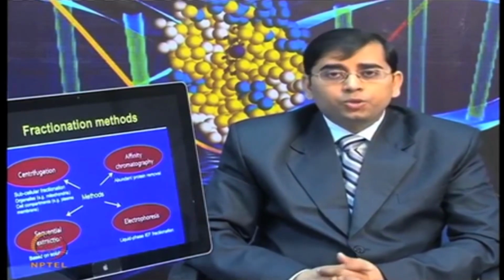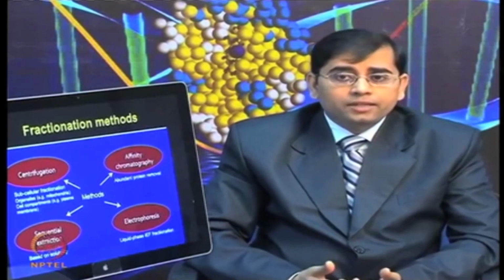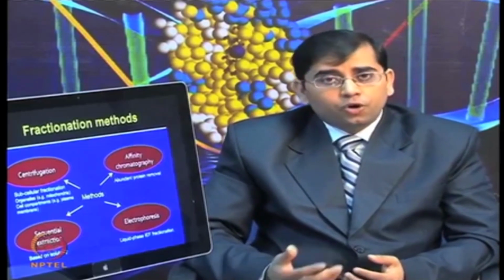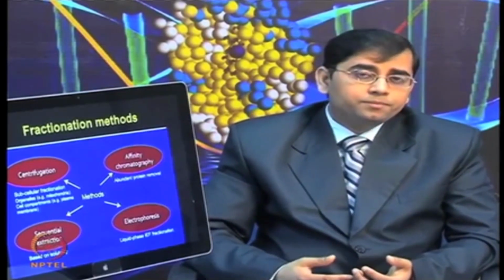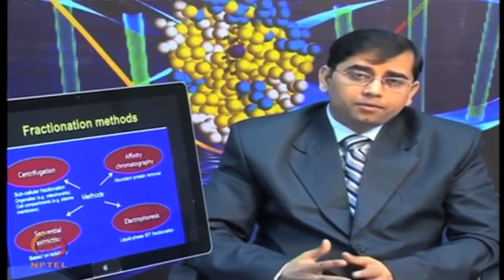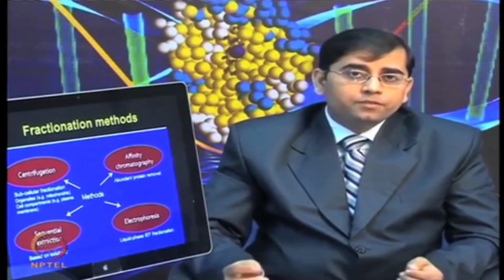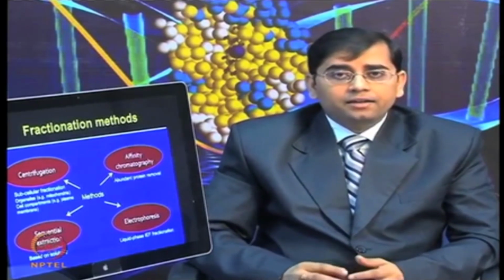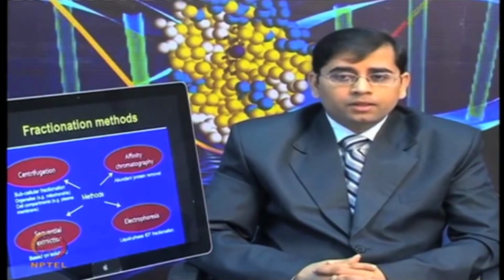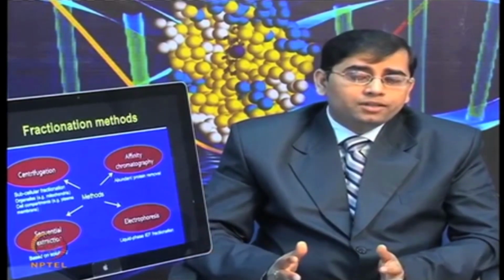Electrophoresis can be used for fractionation. For example, if you are using a gel-free method, where you directly want to extract the protein and analyze it using mass spectrometry, then rather than applying the whole sample directly to liquid chromatography, one can first simplify the proteome by using isoelectric focusing, doing the IEF process in the liquid phase itself. Liquid phase IEF fractionation can simplify the proteome based on the isoelectric point.